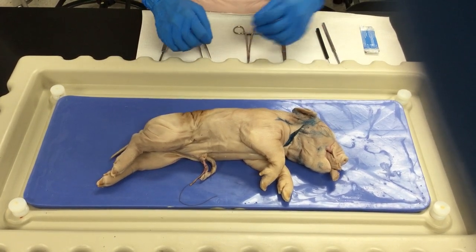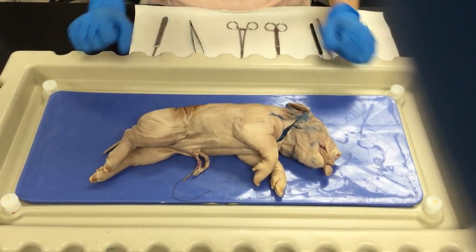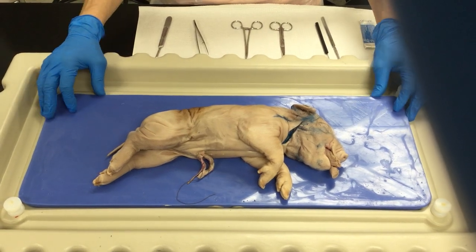Once you clean all your instruments, they're supposed to go back into the tray and clean up everything on the countertop just to have everything as clean as possible.